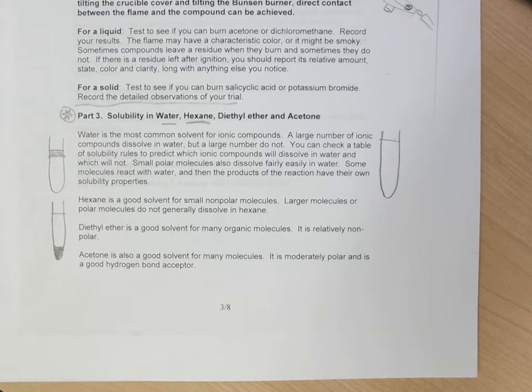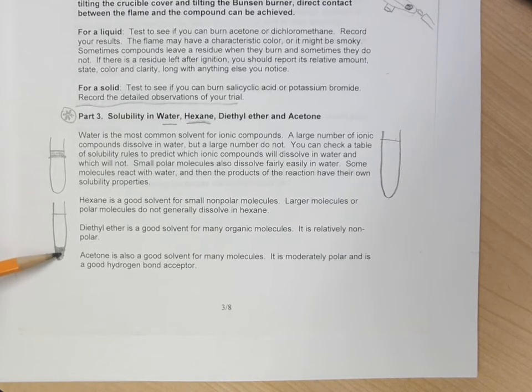So if you try to put a few drops of liquid in a solvent, it will either dissolve or not, and if it doesn't dissolve, it can either float or sink. So that way we get an idea of the density relative to the density of the solvent, which is a good thing to know. With solids, you throw in a few crystals, the same kind of idea. The crystals can float or sink if they don't dissolve, and if they dissolve, you'll see a nice homogeneous solution. And so for just about any compounds you're going to work with, you're going to want to know what it dissolves in and how much.